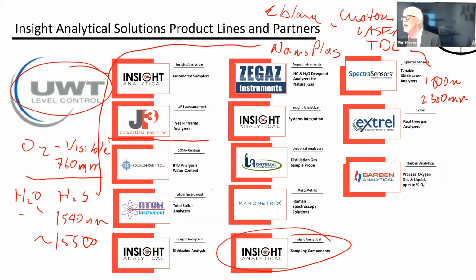Thanks, Rennie. Please do keep me posted. So Paul asked a question as well. T90 is typically about 15 seconds for these. What's the trigger to know the sensor degradation? Is it the slow response?